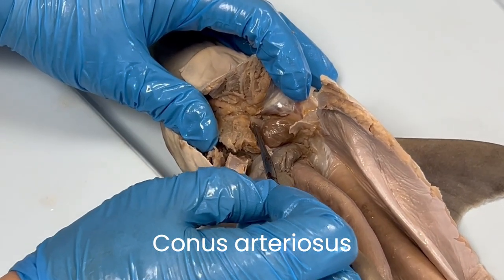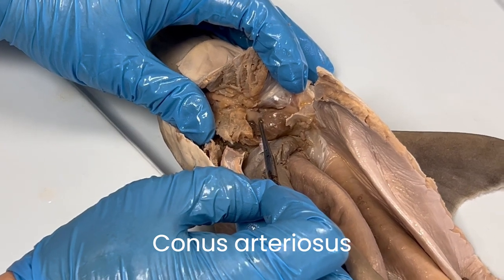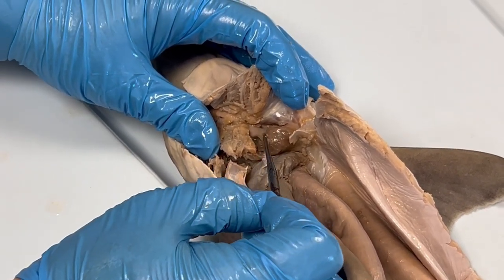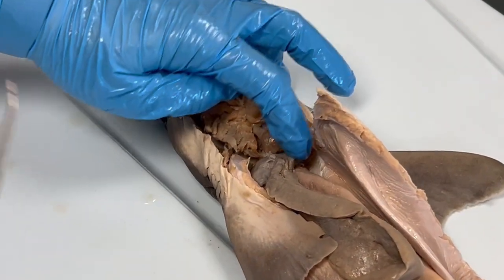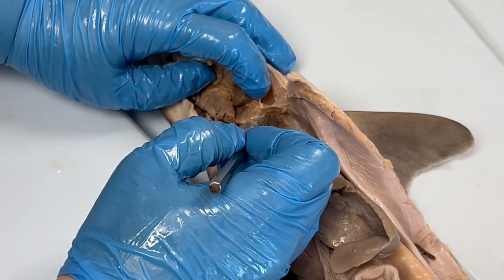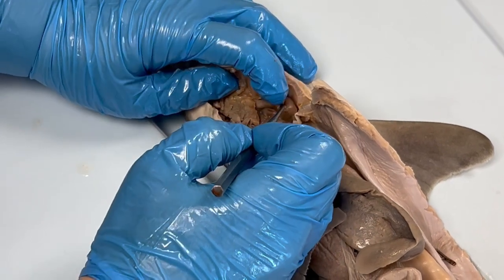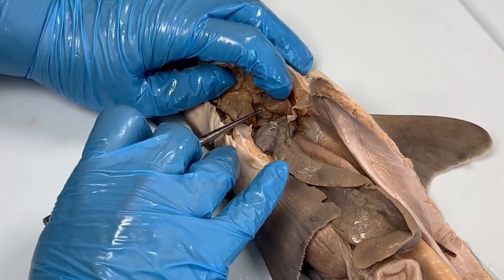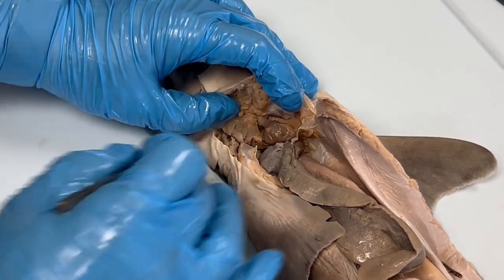The conus arteriosus is a very large muscular vessel that also pumps blood. It contains valves to help direct blood to the gills and other parts of the body. To summarize, the flow of blood through the heart begins with deoxygenated blood entering the sinus venosis, then it moves to the atrium, then into the ventricle, and finally out of the heart into the conus arteriosus.